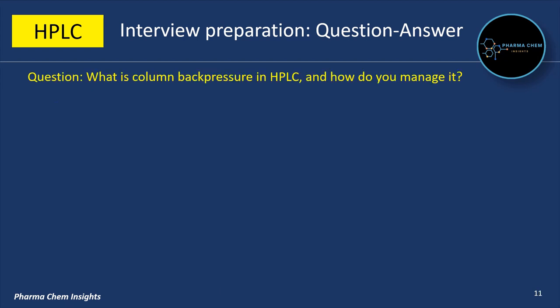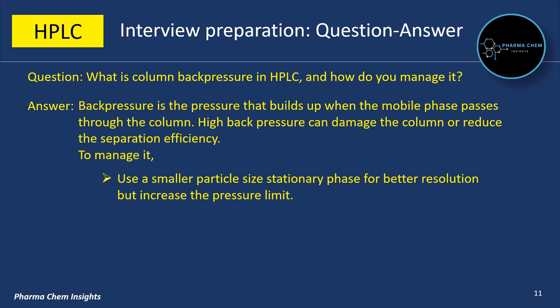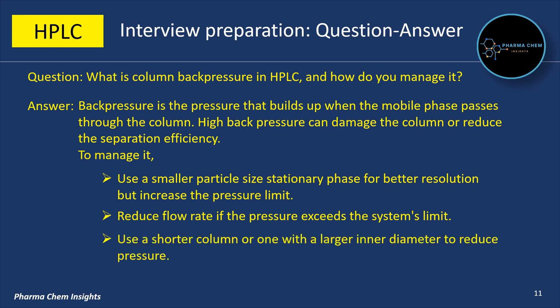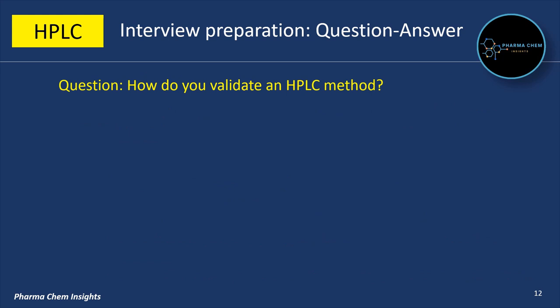Now let's cover column back pressure. You might be asked: what is column back pressure in HPLC and how do you manage it? Back pressure is the pressure that builds up when the mobile phase passes through the column. High back pressure can damage the column or reduce separation efficiency. To manage it: use a smaller particle size stationary phase for better resolution but be aware of increased pressure limits; reduce flow rate if the pressure exceeds the system's limit; use a shorter column or one with a larger inner diameter to reduce pressure; and ensure the mobile phase is properly filtered to avoid clogging the column.